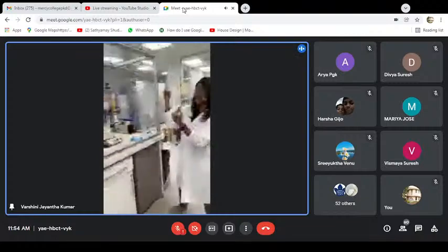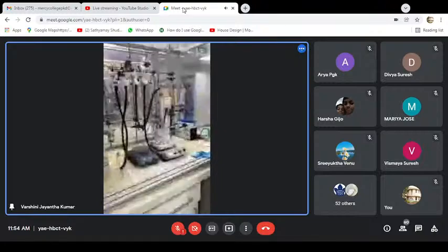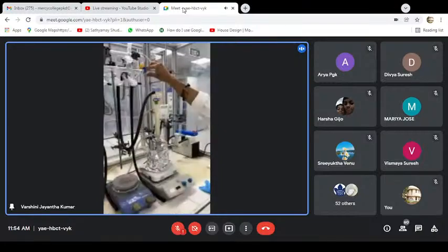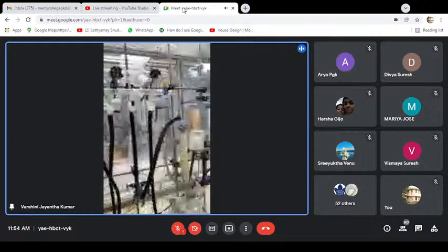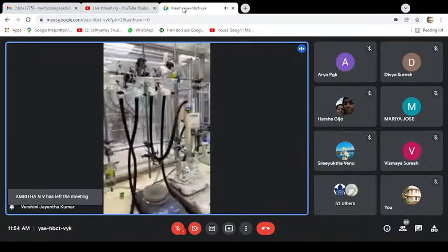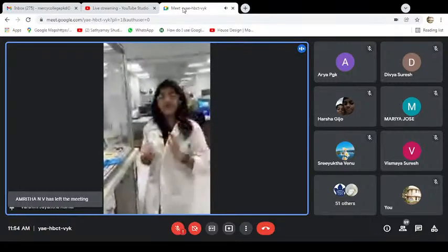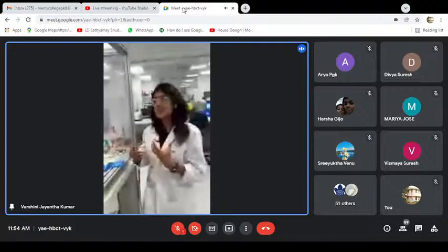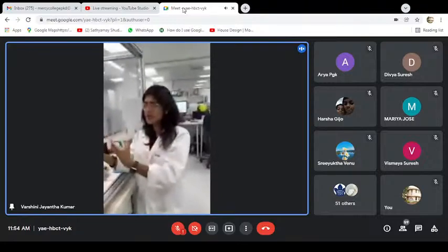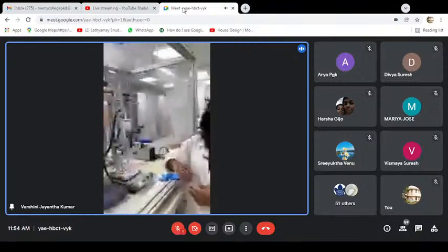This is the fume box that I work with. So I've run a reaction here. This piece of glassware that you see here is called a Schlenk line. As I said before, we work a lot with coordination compounds and organometallic stuff, and they're really air and moisture sensitive. So with moisture sensitive stuff, we dry solvents to get rid of water. But with air sensitive, what do we do? That's why we have the Schlenk lines here.